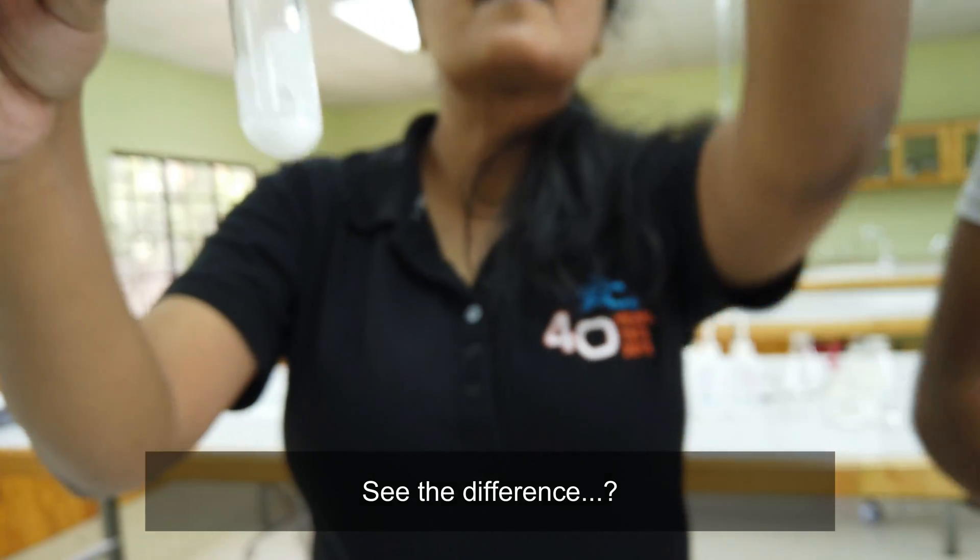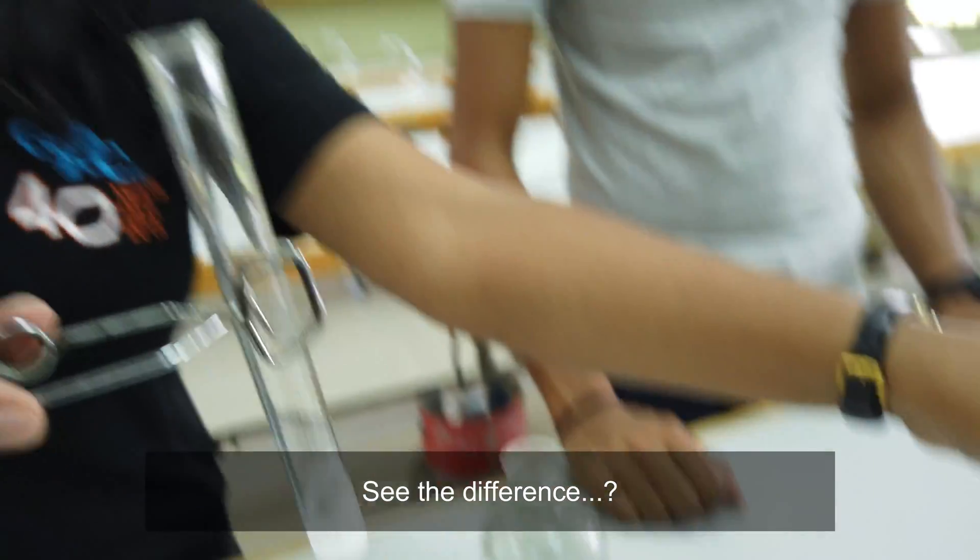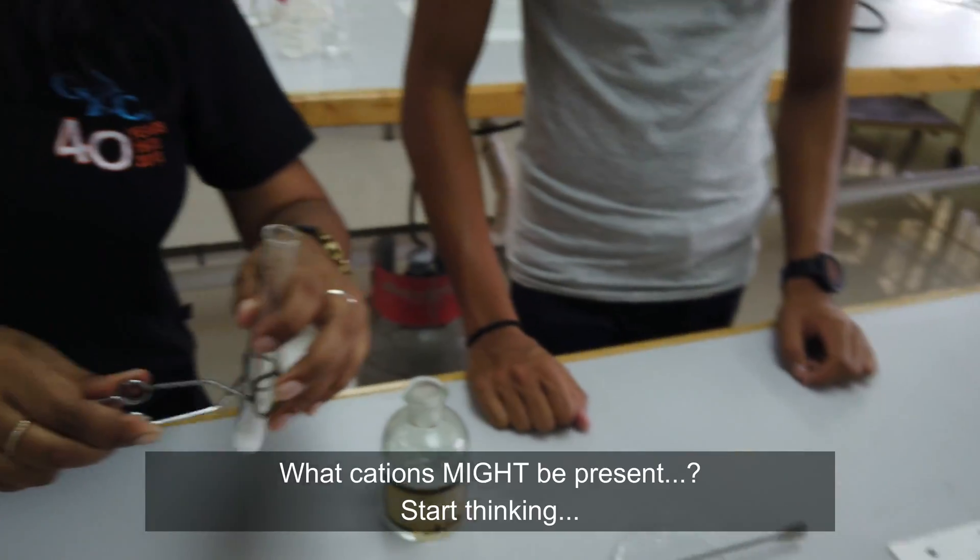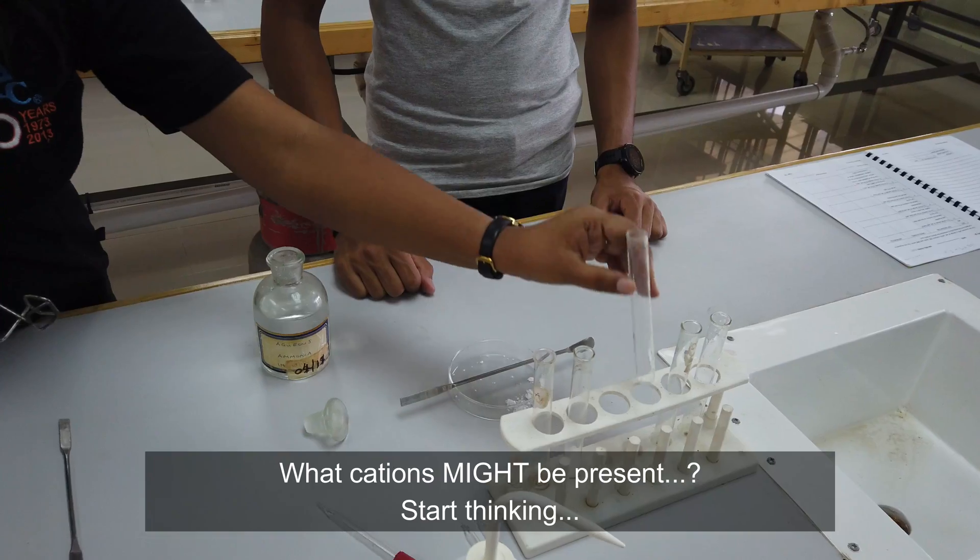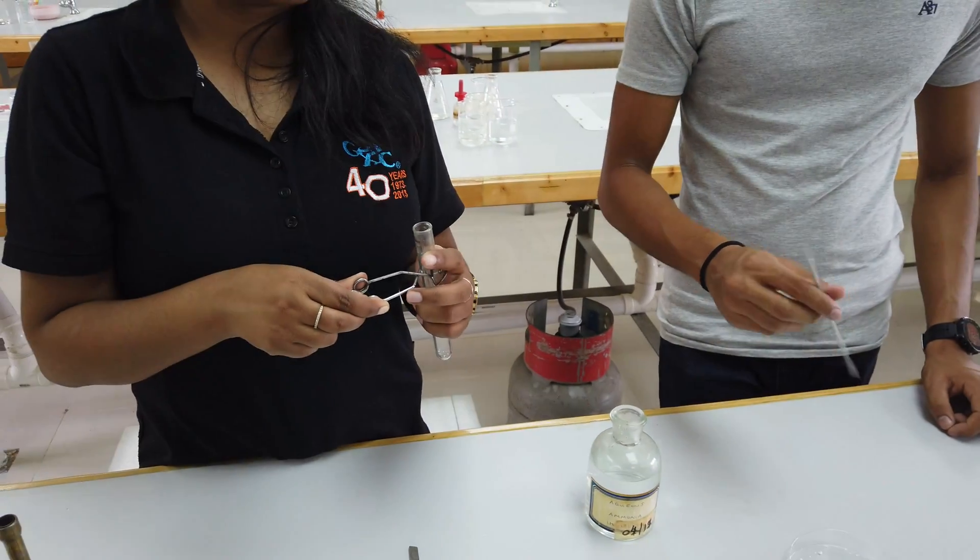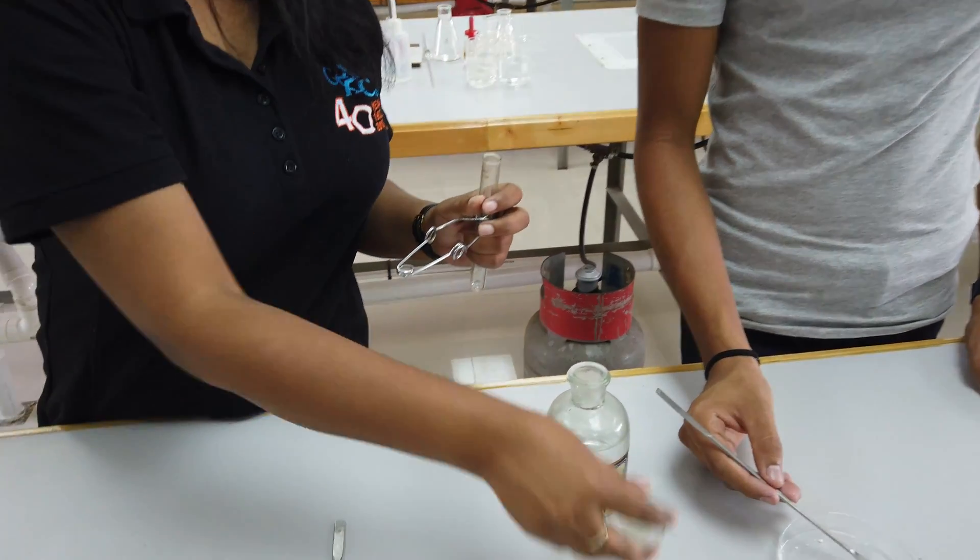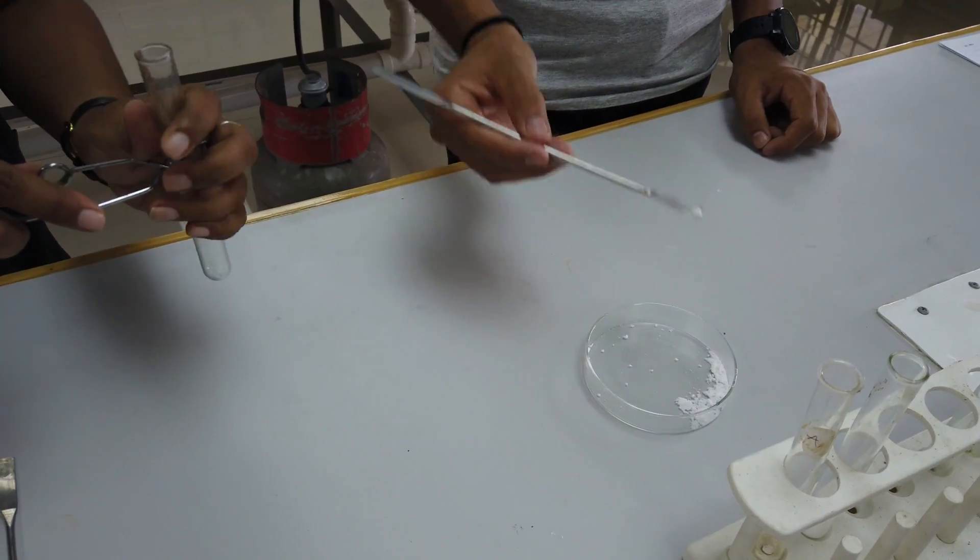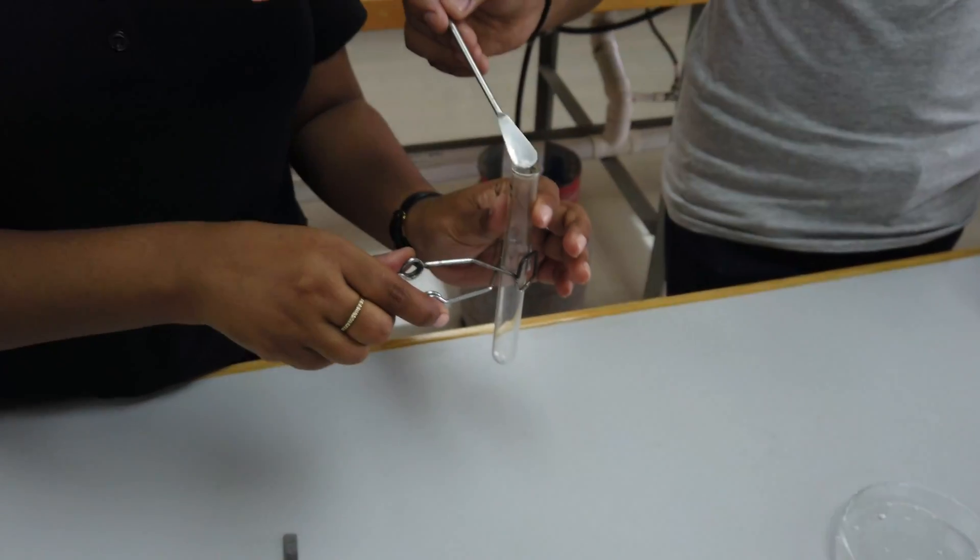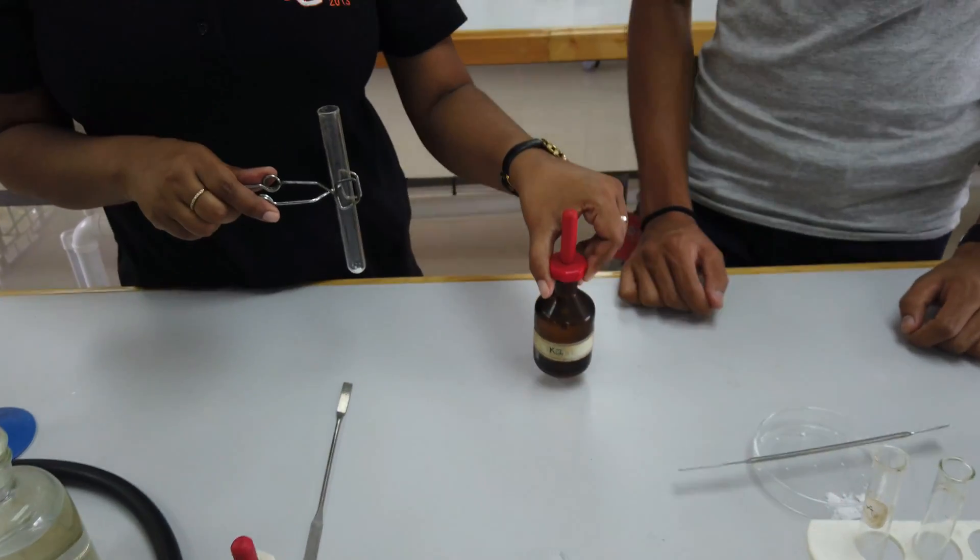This is why I'm saying it's a white precipitate soluble in excess as opposed to a white precipitate insoluble in excess. Now this doesn't help us to narrow down the cation yet, so we're gonna do one more confirmatory test. A little bit of salt once more.